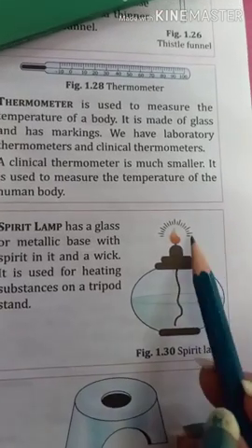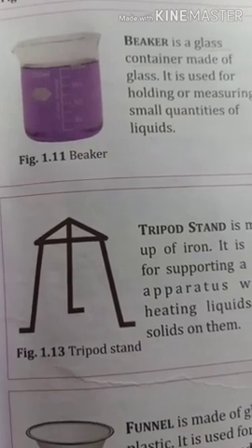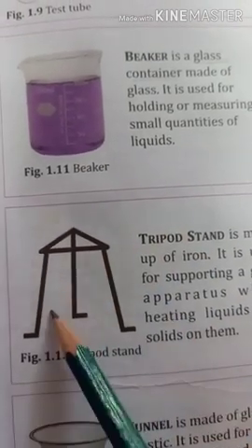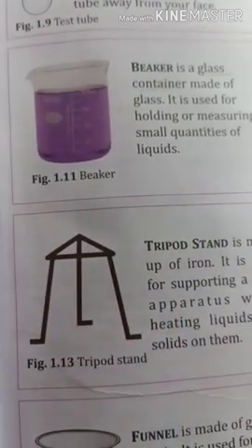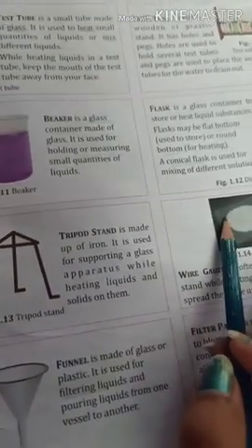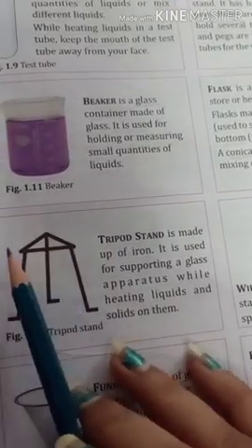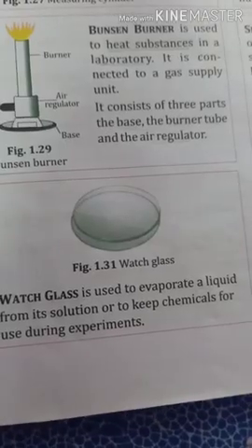That is, upon this spirit lamp we will place a tripod stand. This tripod stand we will place on that spirit lamp, and above this tripod stand we will place a wire gauze, and then we place our container containing liquid.